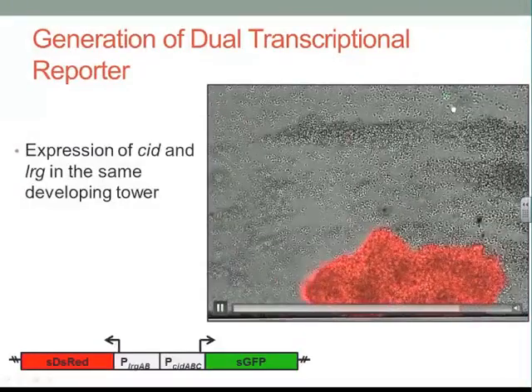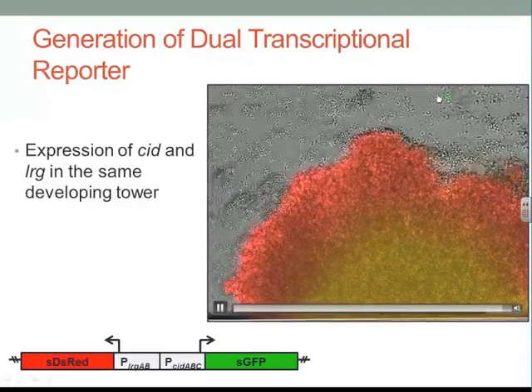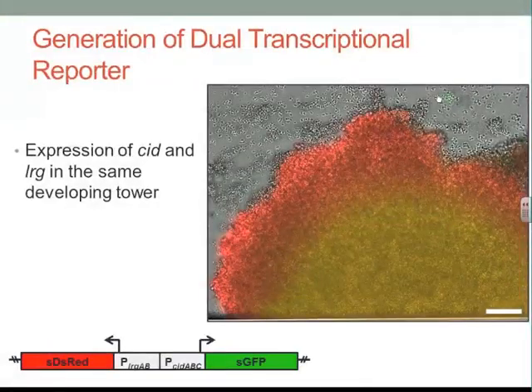It actually looks like they are breaking off, and they could have some other role in biofilm development. Now what we're trying to do is tease apart what these two different biofilm structures are and what their function is in this whole large multicellular community.